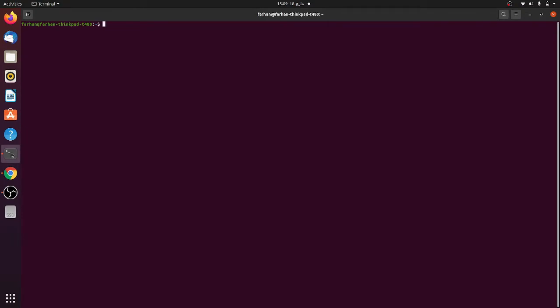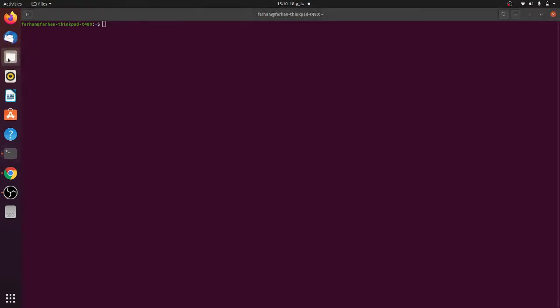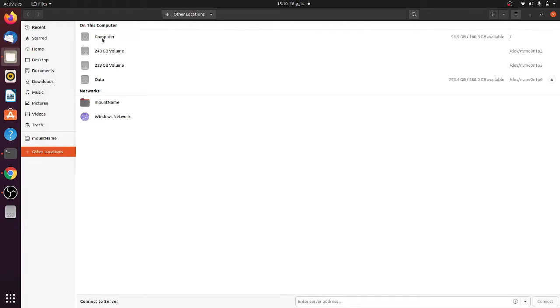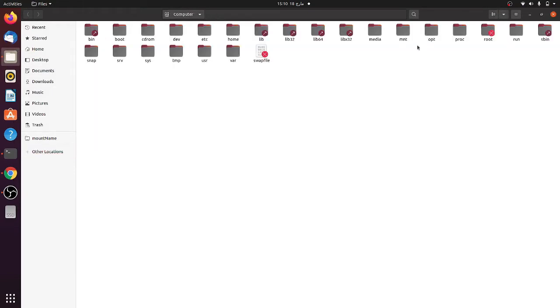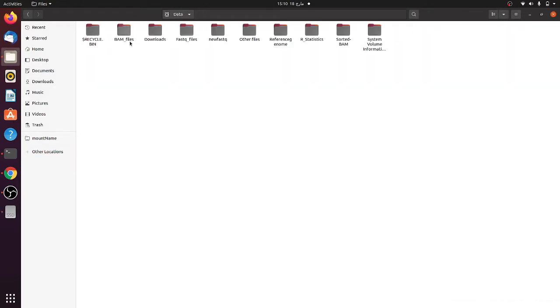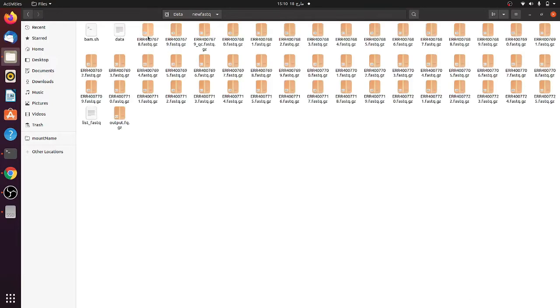We have downloaded a lot of FASTQ files. If I just show you here, for instance, we have a lot of files. These are the new FASTQ files here, you can see that there are a lot of FASTQ files.